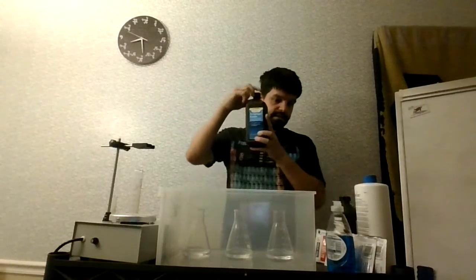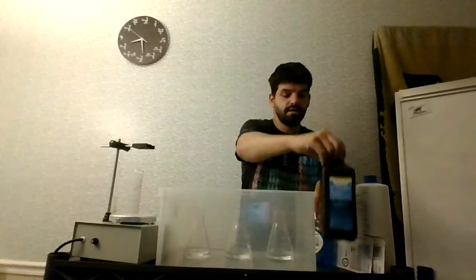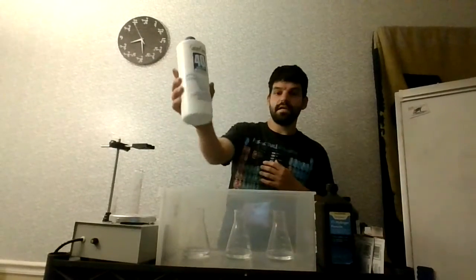But what we'll do to start things off is I'm going to explain what I have in front of me, but we'll go through the supplies first. So as always, we have our hydrogen peroxide. The last time we talked about was the 3%. In this version, we are also going to be using this 40 volume clear stabilized formula.